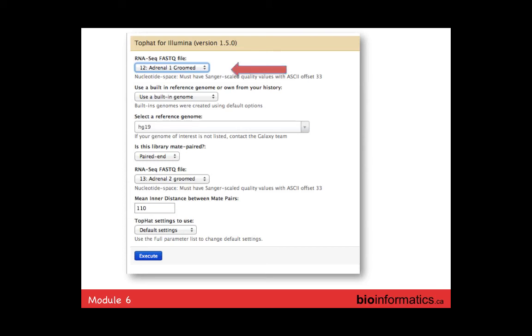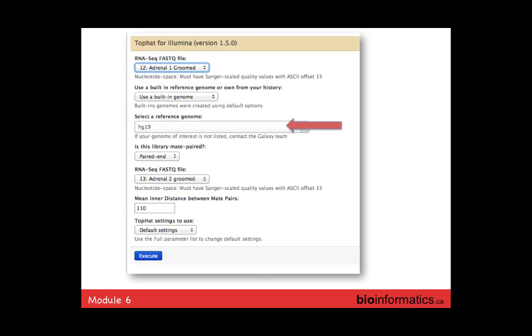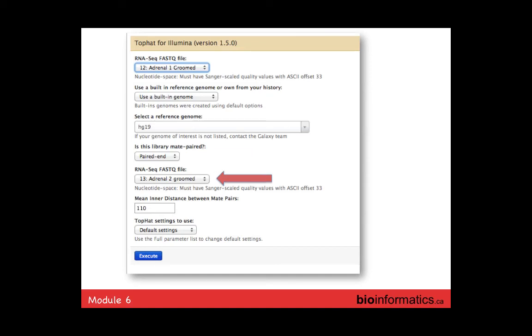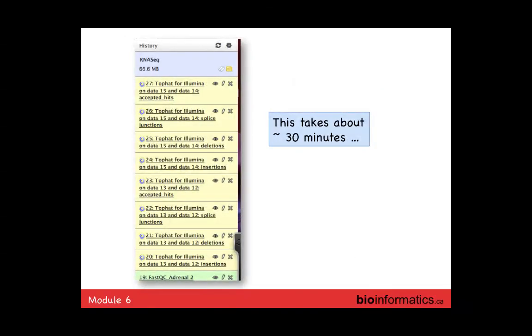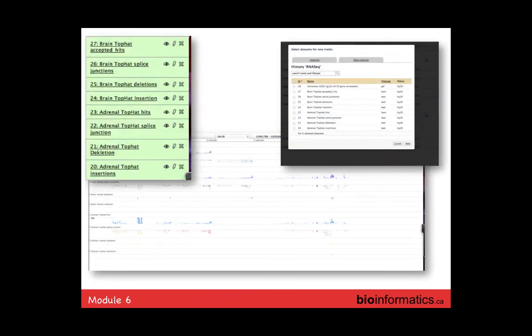To run TopHat, you select the input file, make sure you've done the FASTQ grooming, select the correct reference build, indicate paired-end reads, select the FASTQ file, set the inner distance to 110, and execute. Initially all files are yellow, and TopHat takes about 30 minutes for all files. Then you end up with green files. Galaxy has its own genome browser called Trackster, which is quite nice and fast, with its own advantages and disadvantages compared to the other browsers we've discussed.